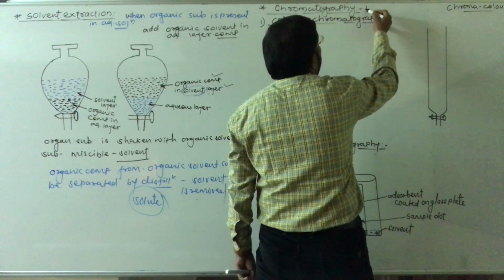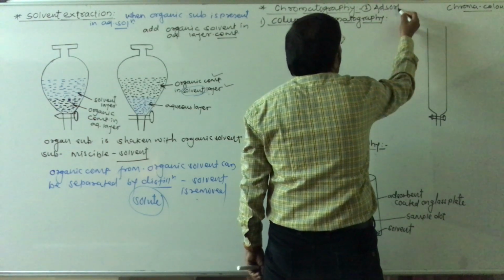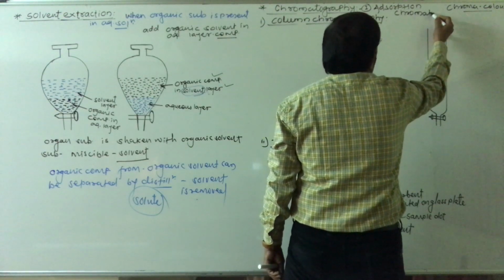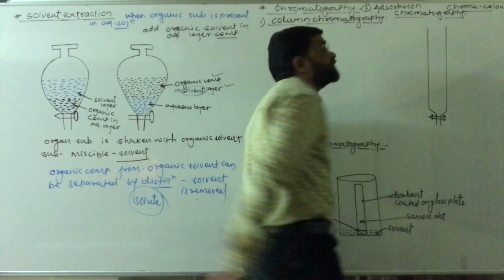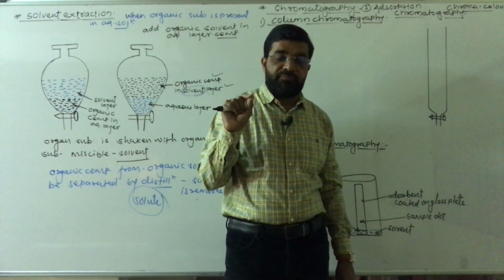So there are two types of chromatography: adsorption chromatography, and the second technique, which we have to study later, partition chromatography.